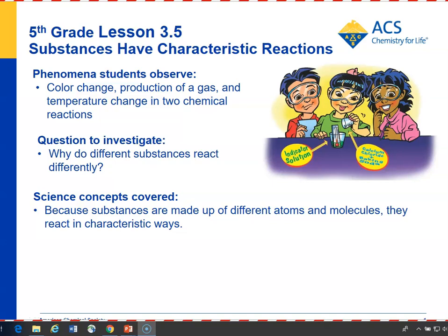In Lesson 3.5, students put calcium chloride and baking soda in an indicator solution, and then they put citric acid and baking soda in an indicator solution. They see two different reactions, and the question is: why do the substances react differently?